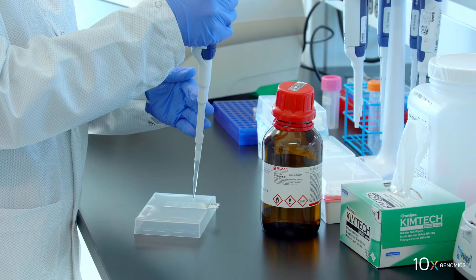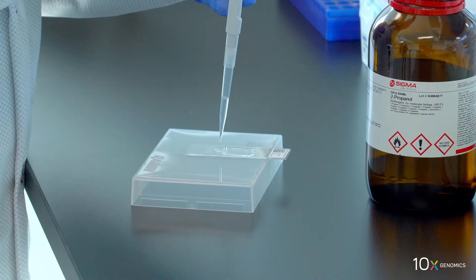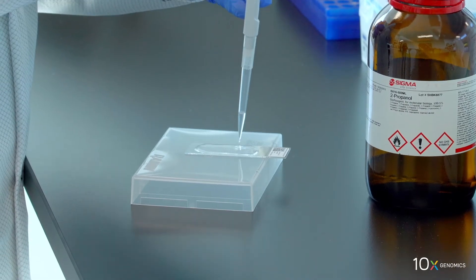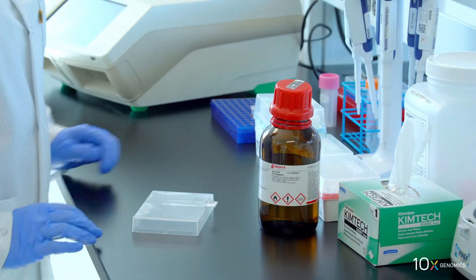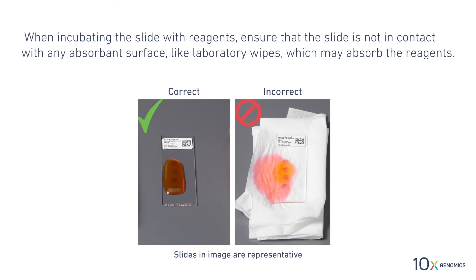Add 500 microliters of isopropanol to the slide to uniformly cover all tissue sections. Keep the slide flat on the bench when adding reagents to the active surface. Incubate for one minute at room temperature. When incubating the slide with reagents, ensure that the slide is not in contact with any absorbent surface.